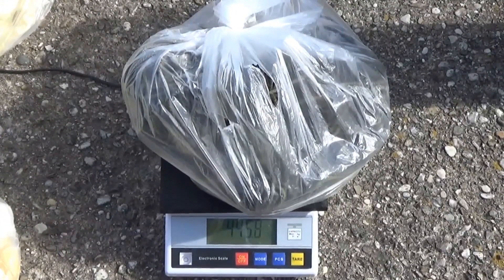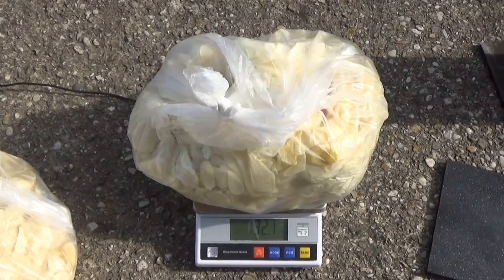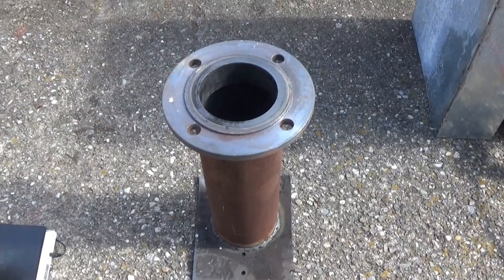Due to the corona crisis I had a little time to spare to work on the pyrolysis project, so I built a brand new reactor and so far I can tell you it's amazing.